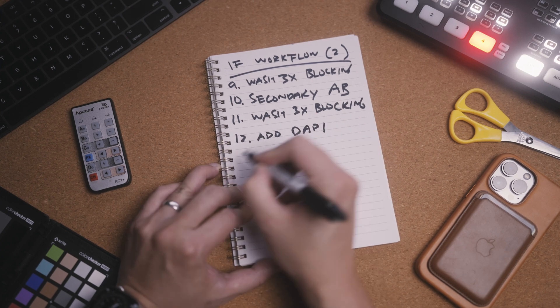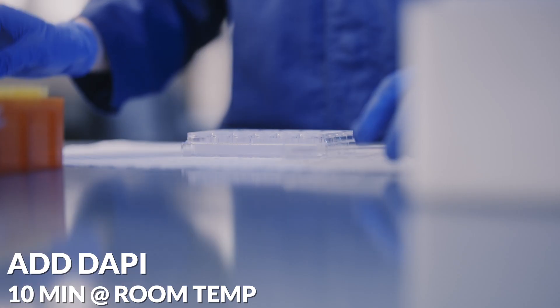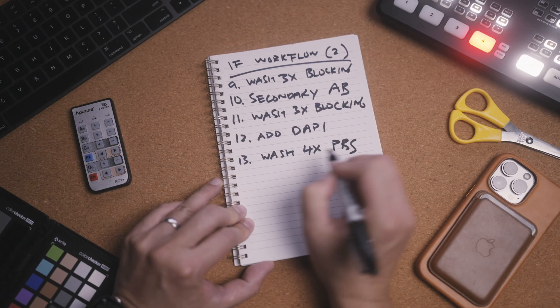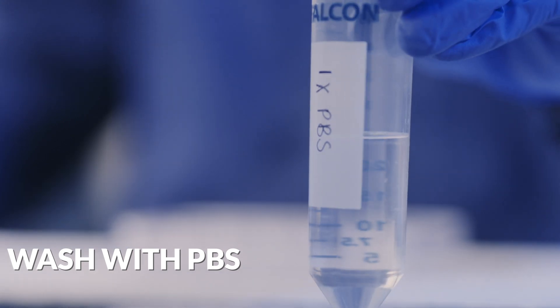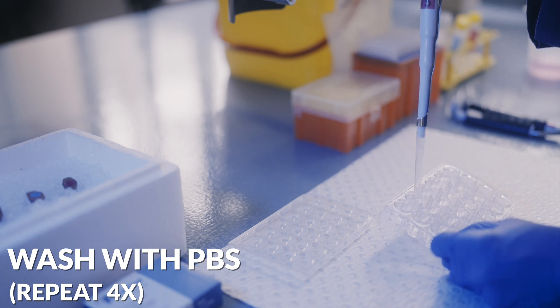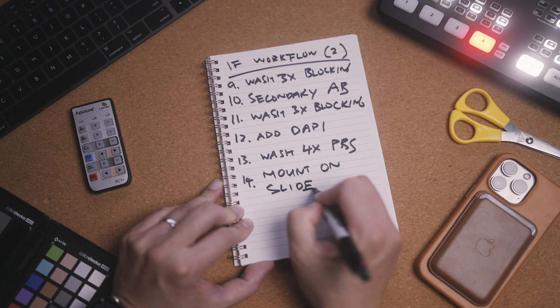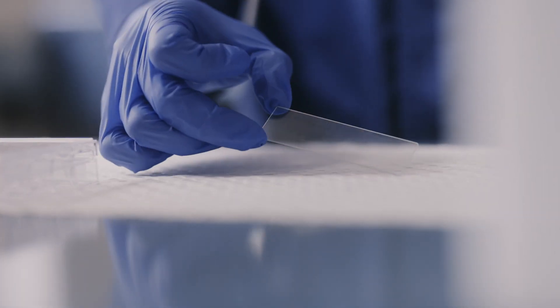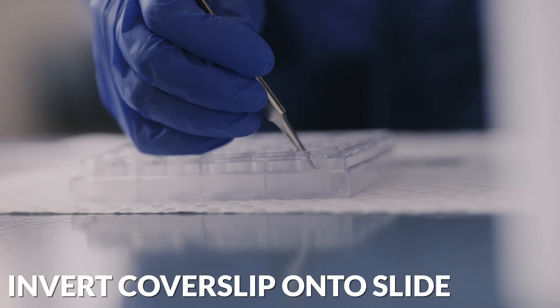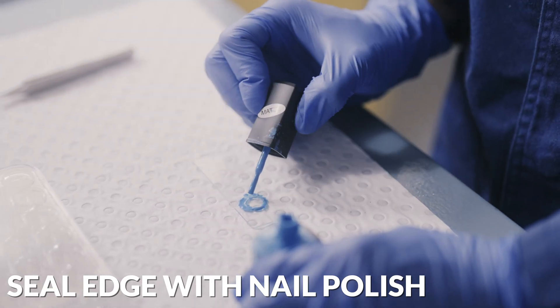We add the DAPI stain and leave it for 10 minutes at room temperature. Then perform 4 washes, this time with PBS and not blocking solution. All that's left is to mount it to a glass slide — add a drop of mounting media and invert the side of the coverslip with cells on onto it. Let the sample dry before sealing the edges with nail polish, and we are now ready to image the samples.